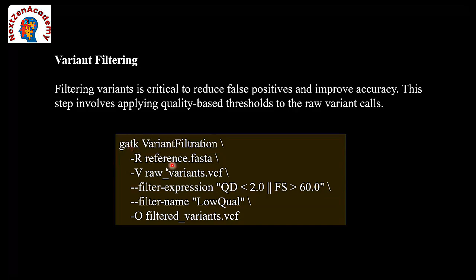Once we get the GVCF, we'll do the joint calling, joint genotyping, with a list of samples. Here you can see I have given the text file that should be in a particular folder. That list location has been given, and then we call the joint genotype variants, which gives the output in a single VCF file that has the variants from all the samples.